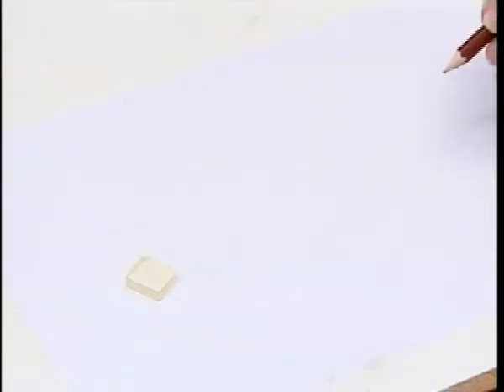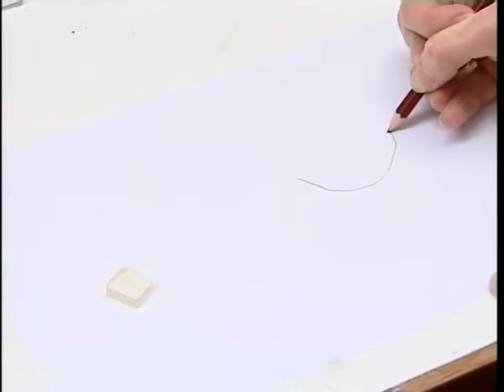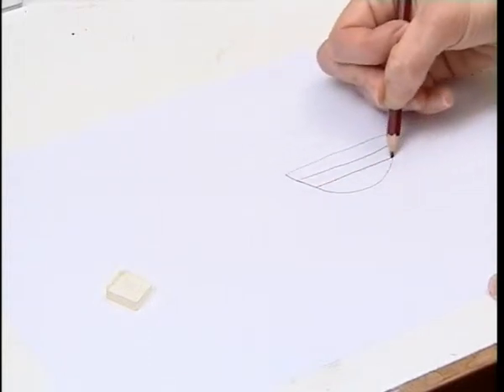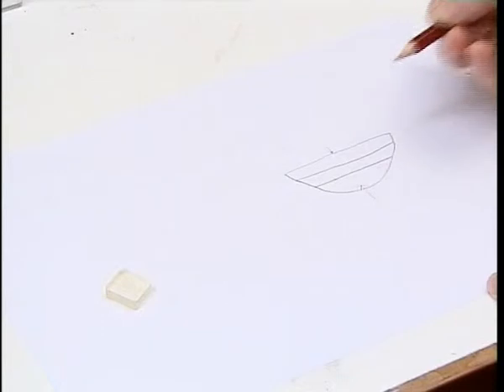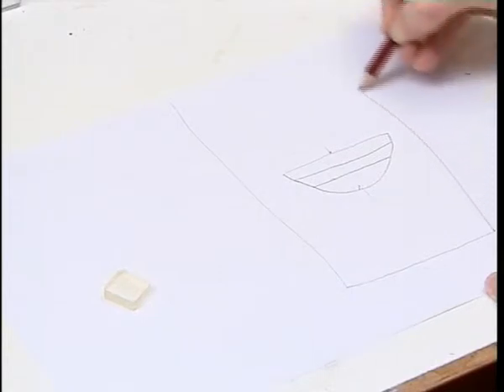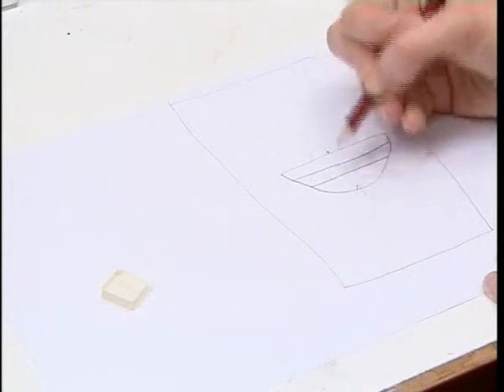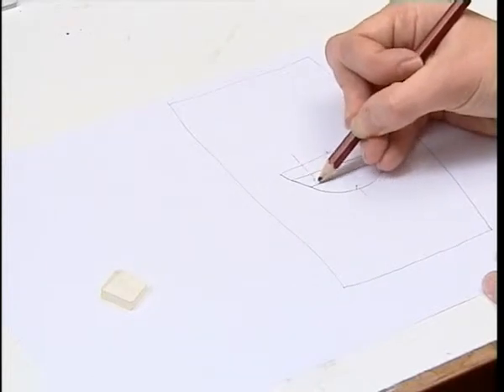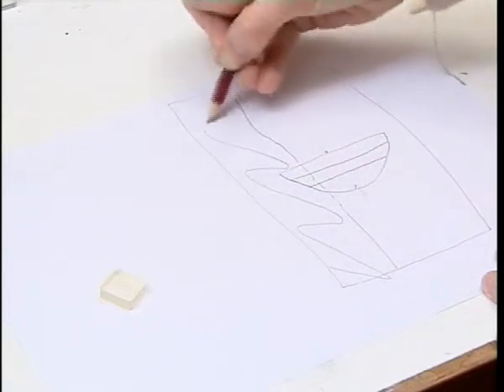Usually when I take a sample from a painting with a scalpel, we end up with a piece of paint which is a triangular shape like this. It has lots of layers of paint, and this is the surface of the paint, and this is the bottom layer of the paint here. We then mount it in the polyester resin block like this, and then we want to get a cross-section through the paint layers so that we have a nice flat surface to look at under the microscope. So we need to grind away this part of the resin block.